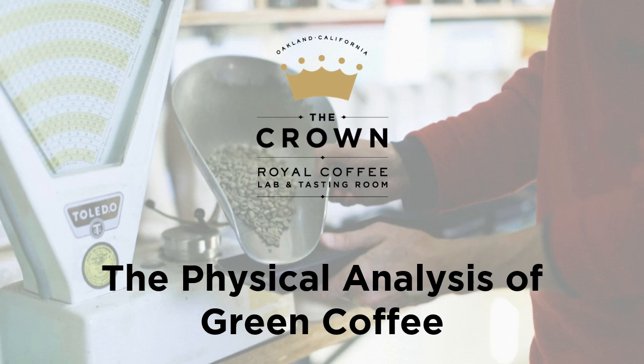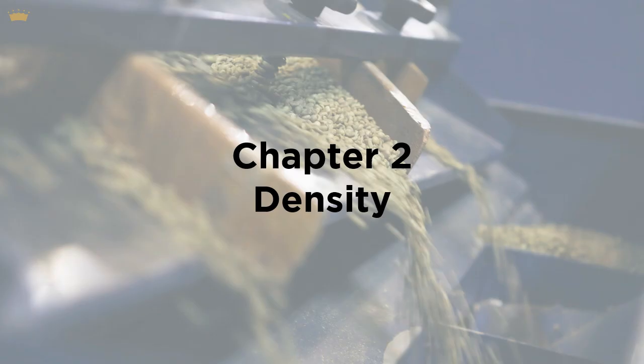Over the next few pages, we'll seek to cover both introductions to broad concepts and to dive deeply into misunderstood corners and clarify complex concepts in order to demystify the physical analysis of green coffee. This is chapter 2 of 4 in our series on green coffee analysis, and we'll be covering density today. The other chapters include screen size, moisture and water activity, and physical defect count. If you're interested in further reading, our blog, royalcoffee.com/blog, has a number of really interesting educational materials.